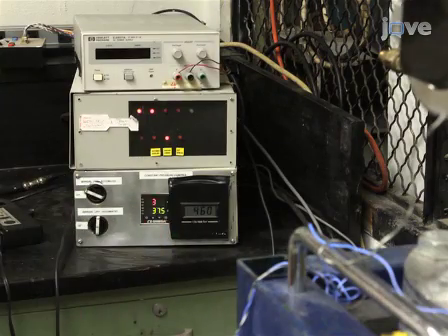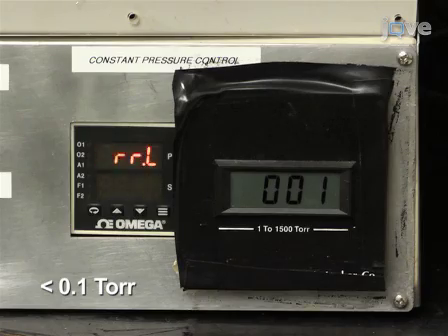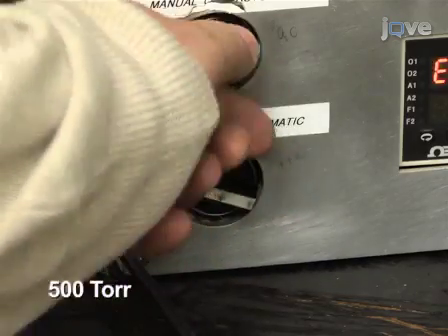To ignite the arc plasma, pump down the cylindrical chamber to a pressure of less than 0.1 Torr of vacuum and then fill it with helium to 500 Torr.